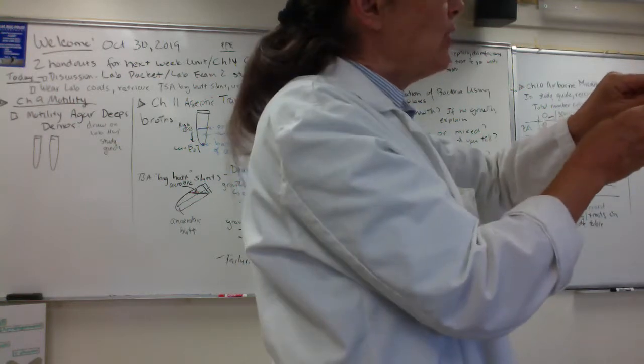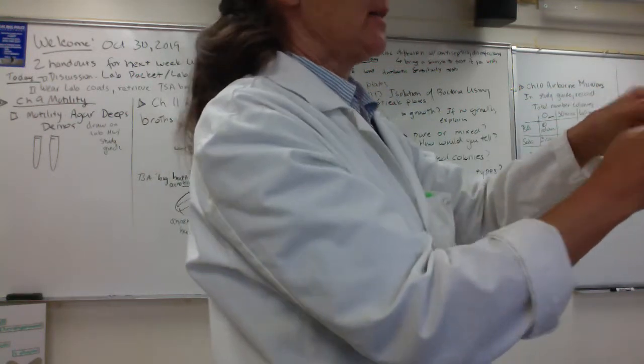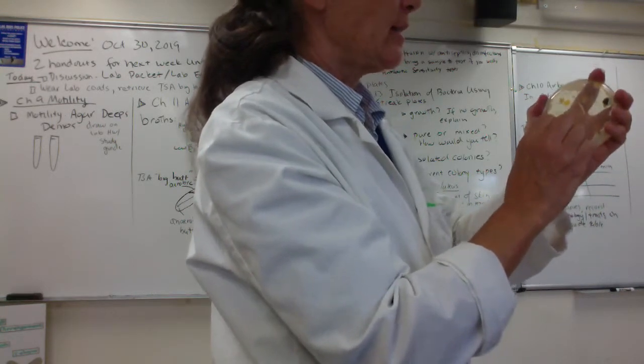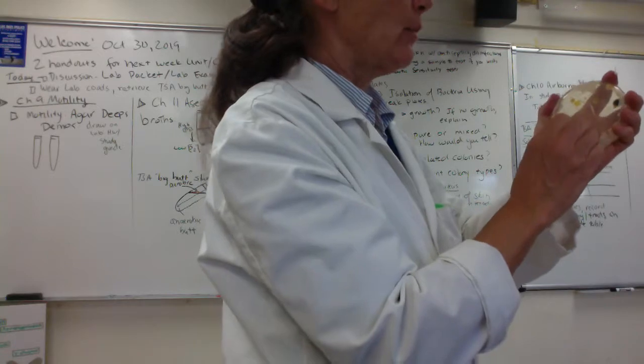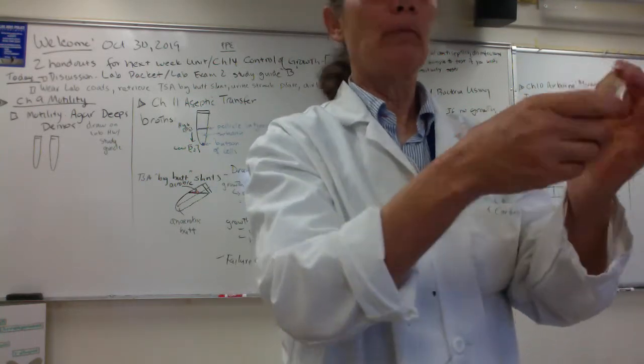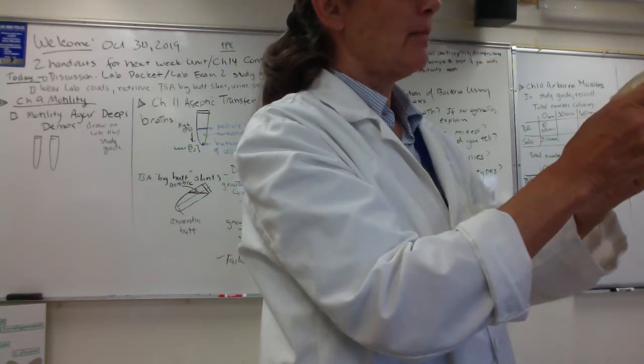But what we want to do, you guys, is peel back the tape from the bottom, because again, the tape will hide the presence of a lot of your colonies. And it's important we count all the colonies, right? No matter how little, no matter how big, each colony counts. We're counting total number of colonies, okay?